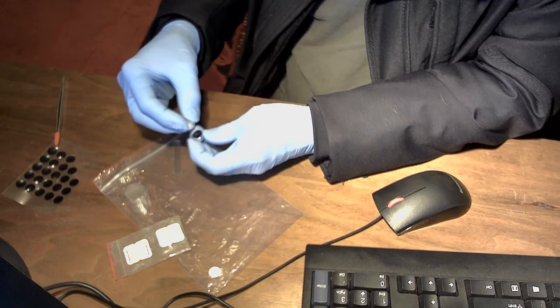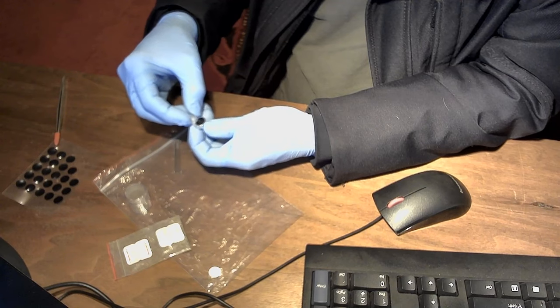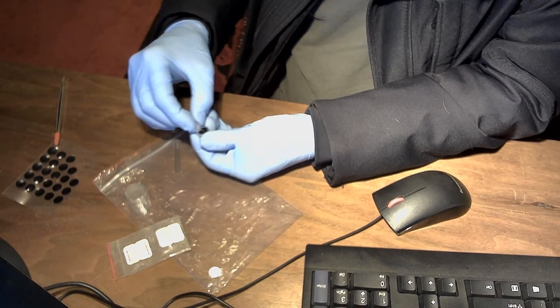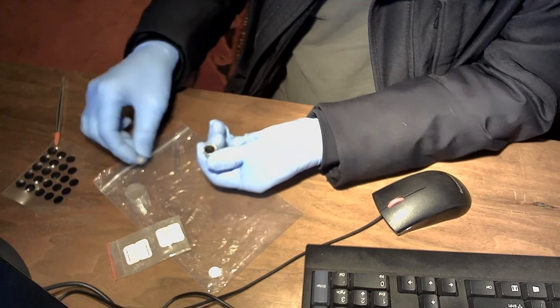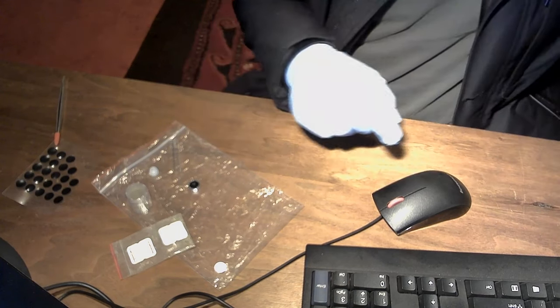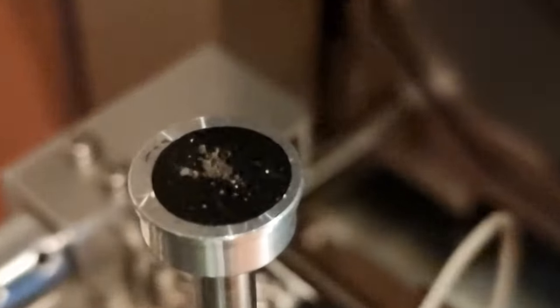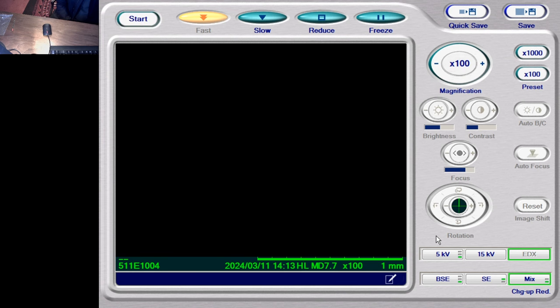What are these magnetic particles that we have extracted from this cavitation reactor from Bin-Juine Huang? What are they? Okay, so they are on that stub now, and we're going to put this in the microscope. Here is the material on the SEM. So you can see it there. So at the moment it's trying to evacuate the chamber. Hopefully it will get there. Seems like it might have done.